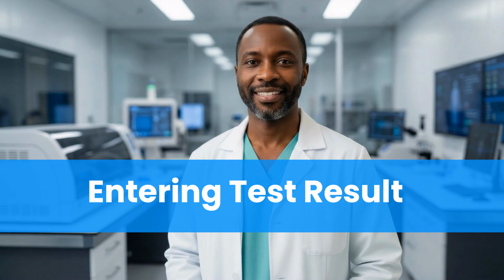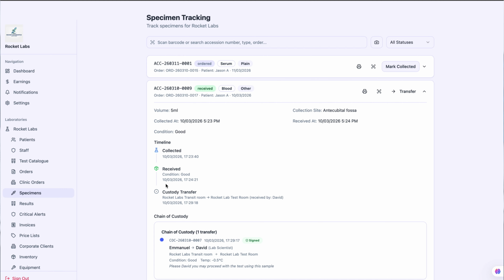So the lab scientists have done the testing and the result is ready. How is the result entered in this LIMS? Results are entered from the orders page or from the results page.